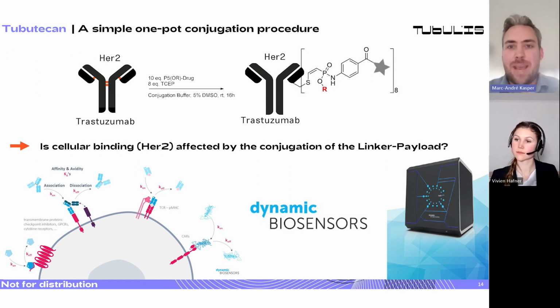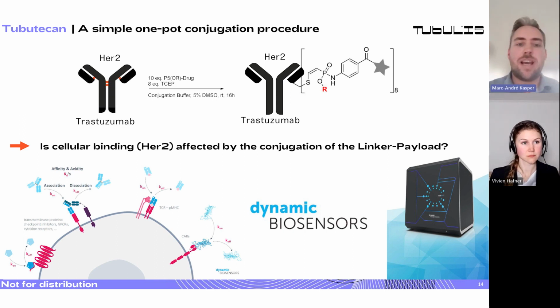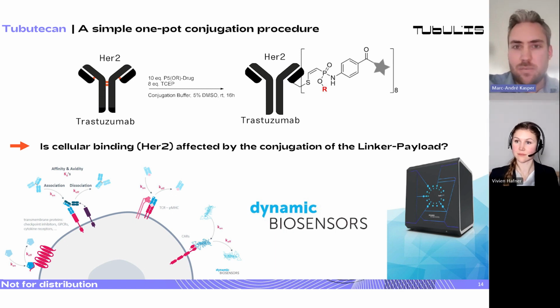First of all, it depends on the payload that it gets really liberated, for example, by a protease to have its full efficacy inside of the cell, because when you do not tracelessly release the payload, then sometimes it's not that active anymore. But even more importantly, it's important to have something like a bystander effect, which only works when you release the free payload in the cell, which helps to eradicate heterogeneous tumors where not all of the cells in your tumor actually express the target. So long story short, yes, we use protease activatable linkers to liberate the payload, and we think it's important to do so.